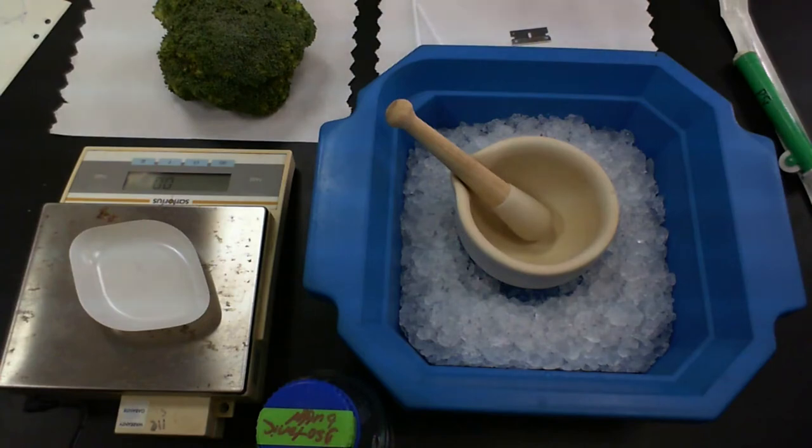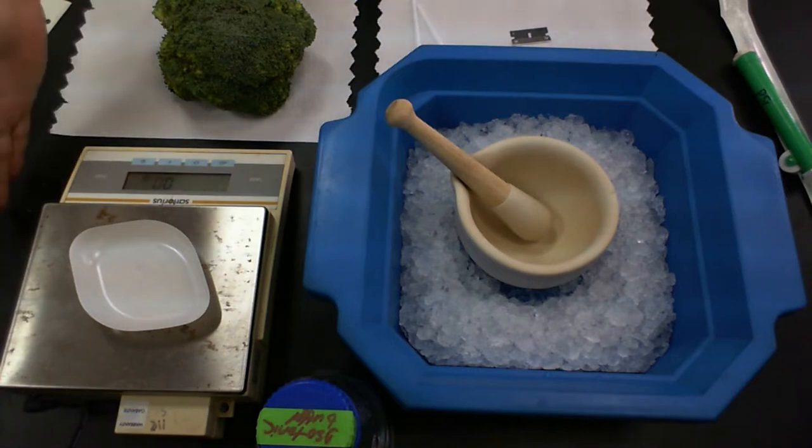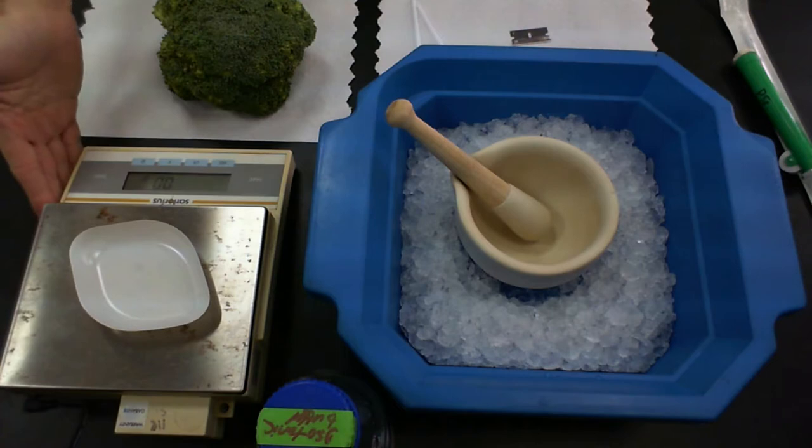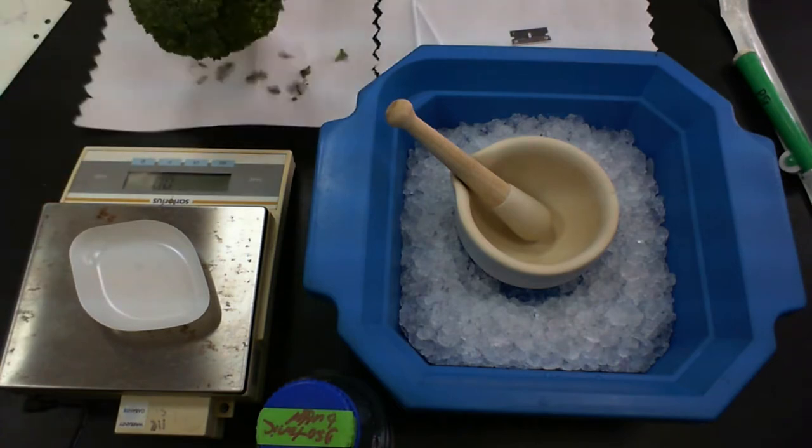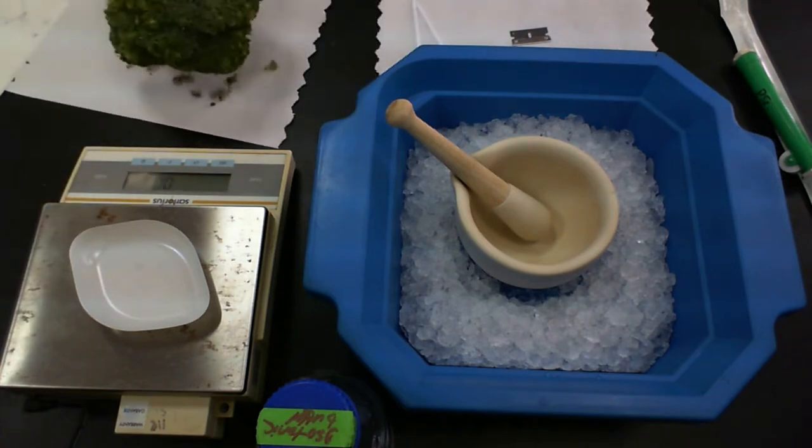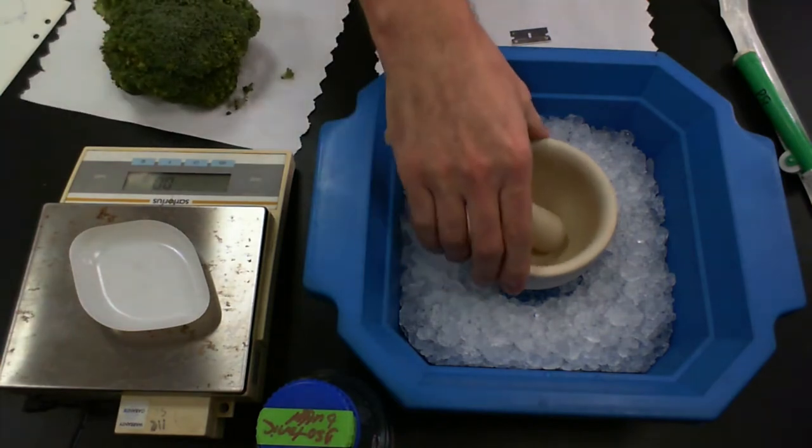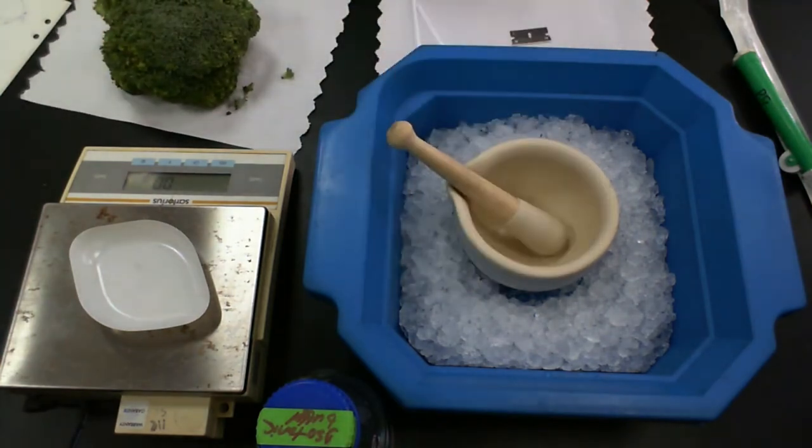Okay, so here we are. What we have in front of me is a scale, so I can weigh out the appropriate amount of my broccoli. I have my sample, this is my broccoli here, and I have a mortar and pestle sitting on ice, so it's nice and cold.